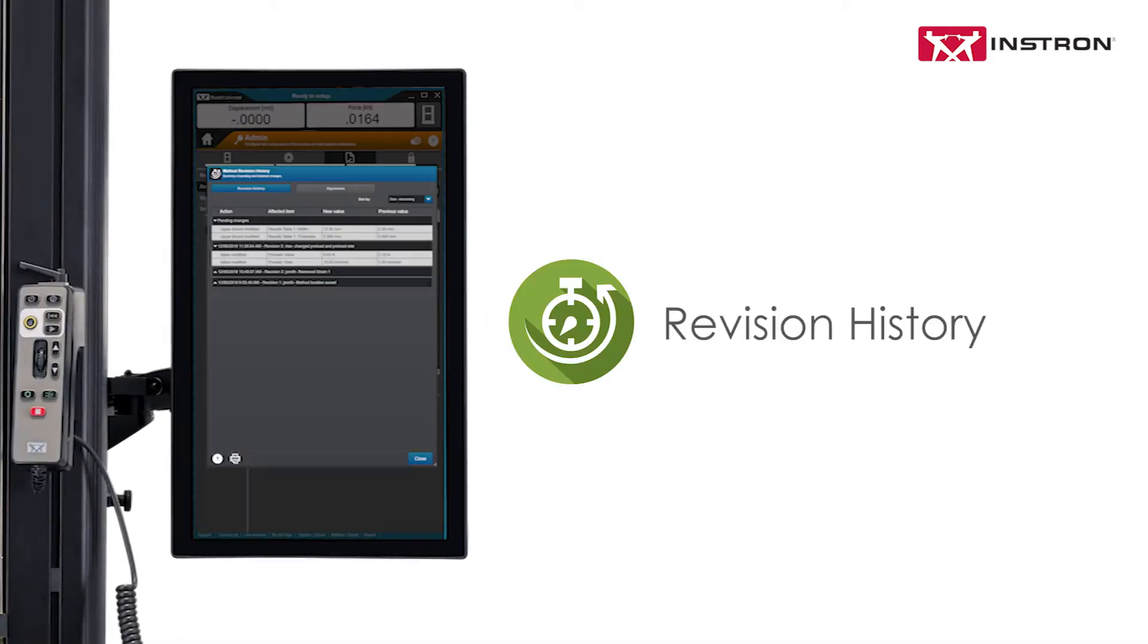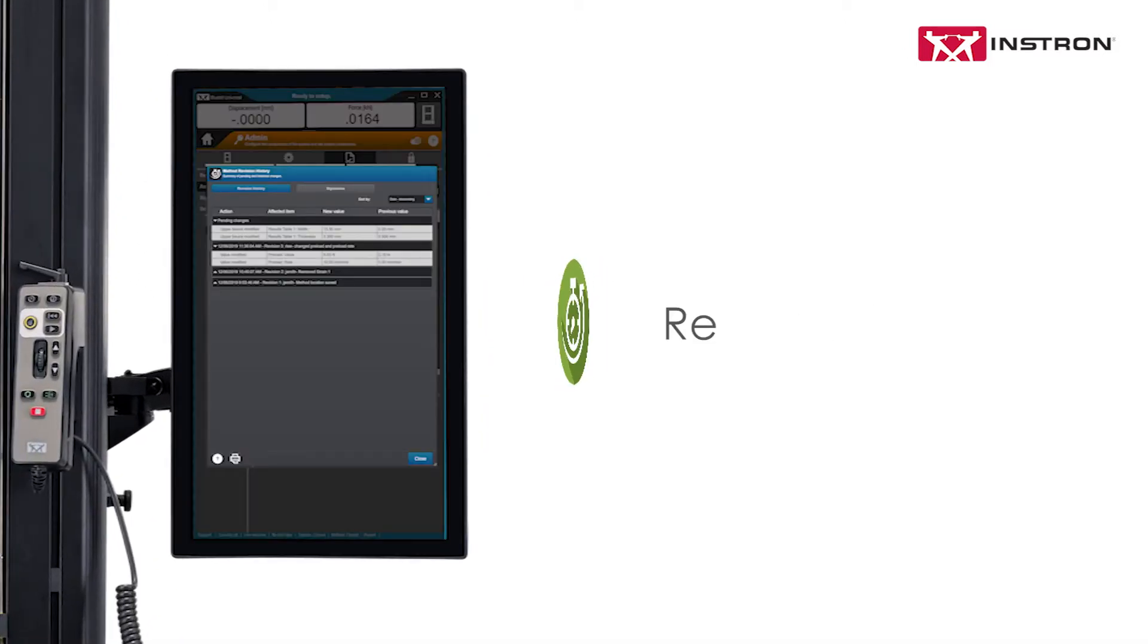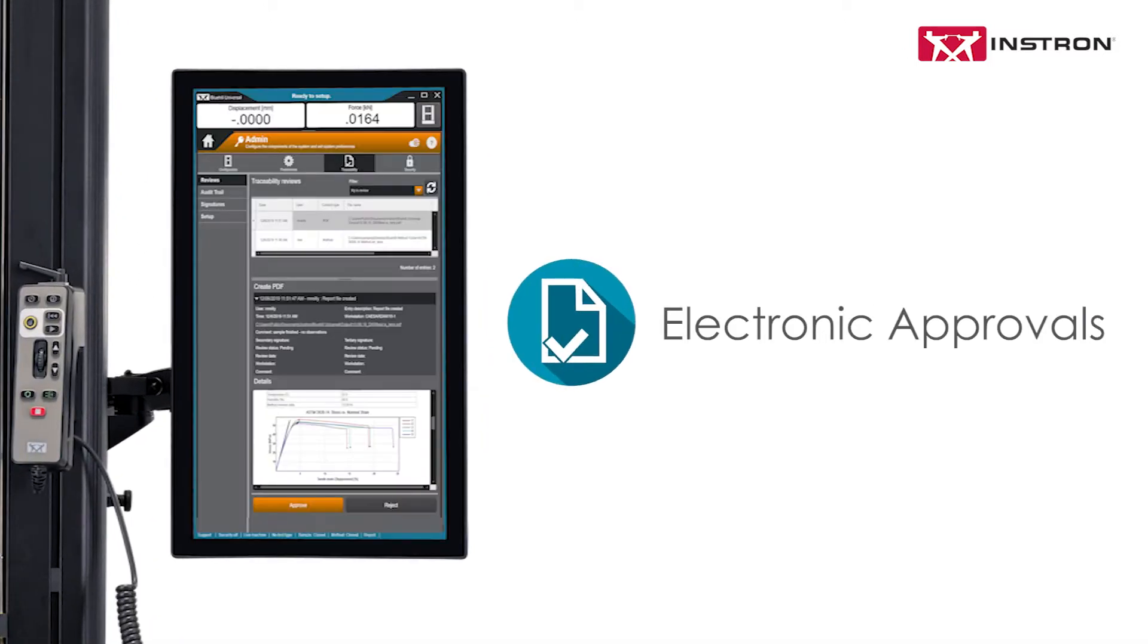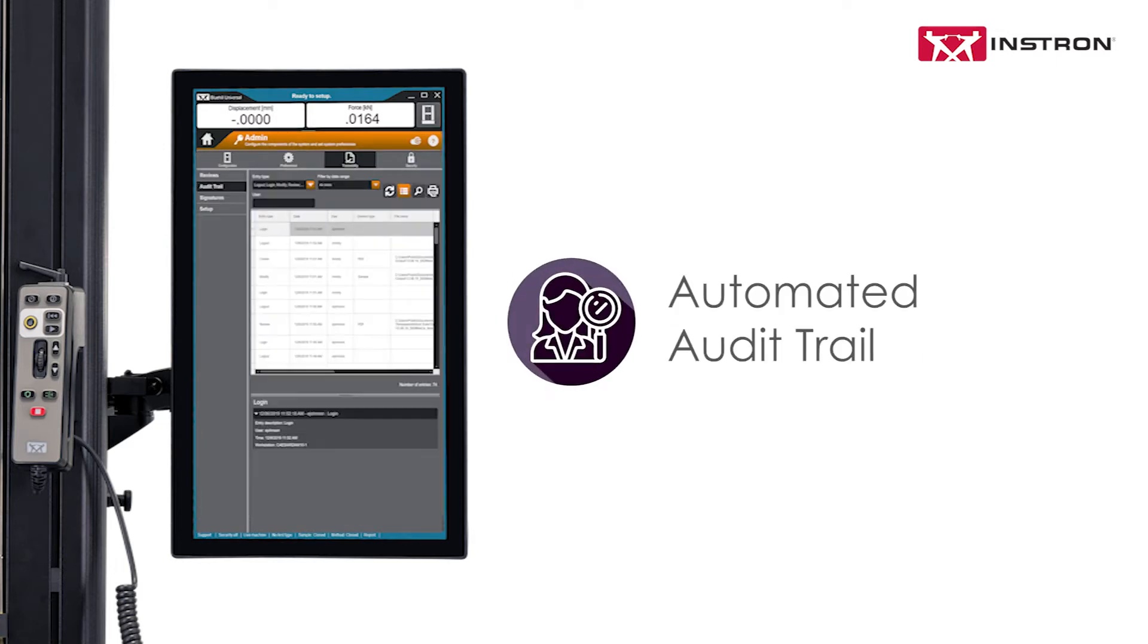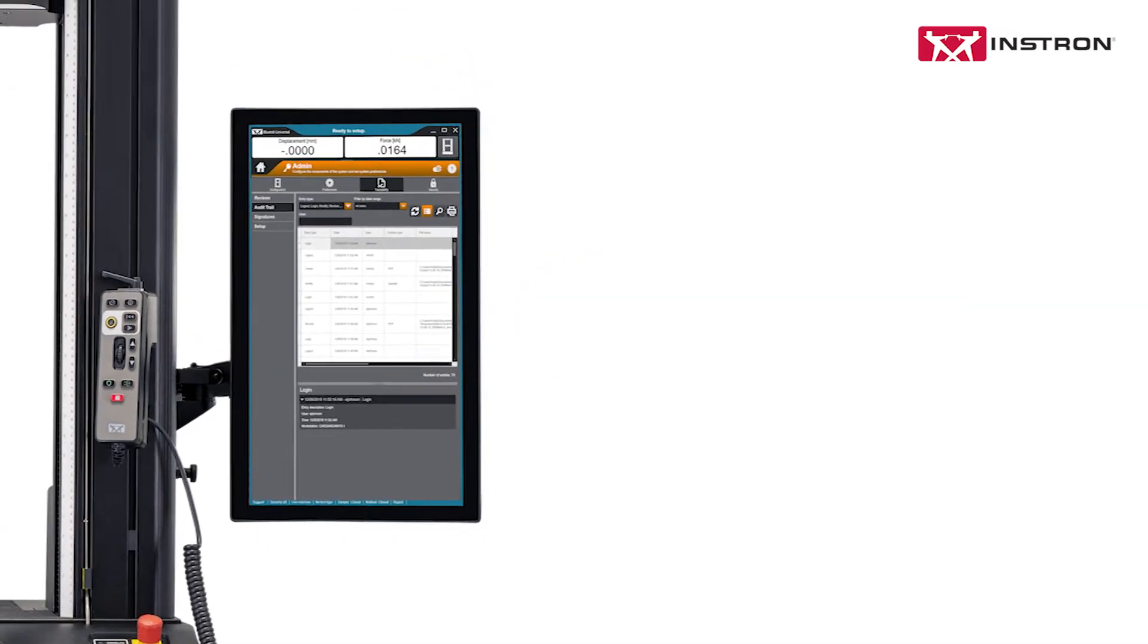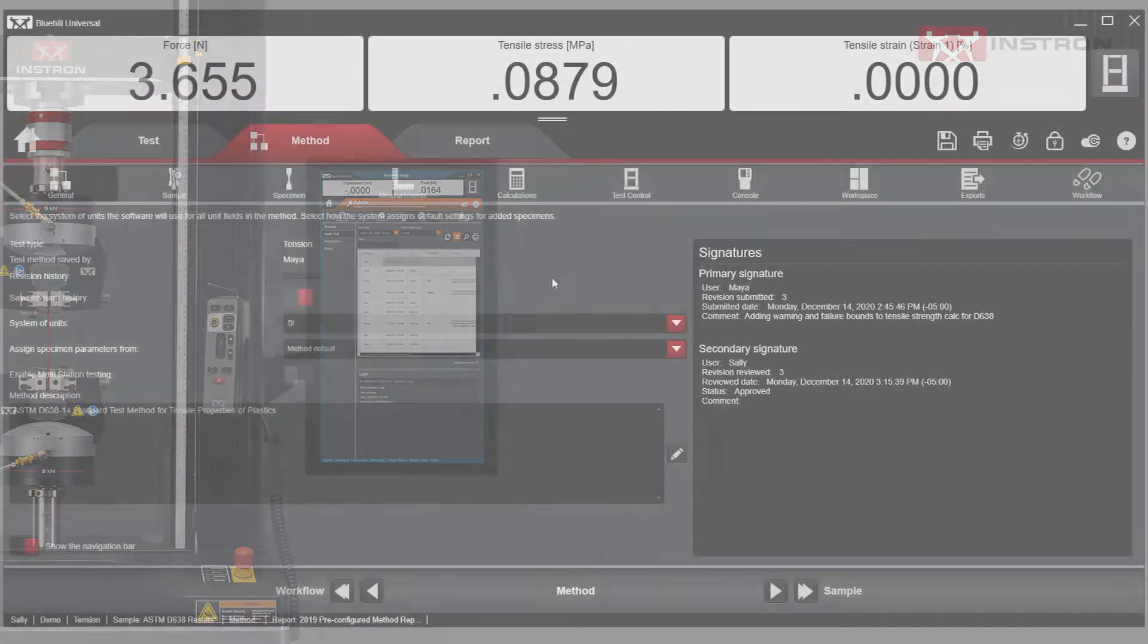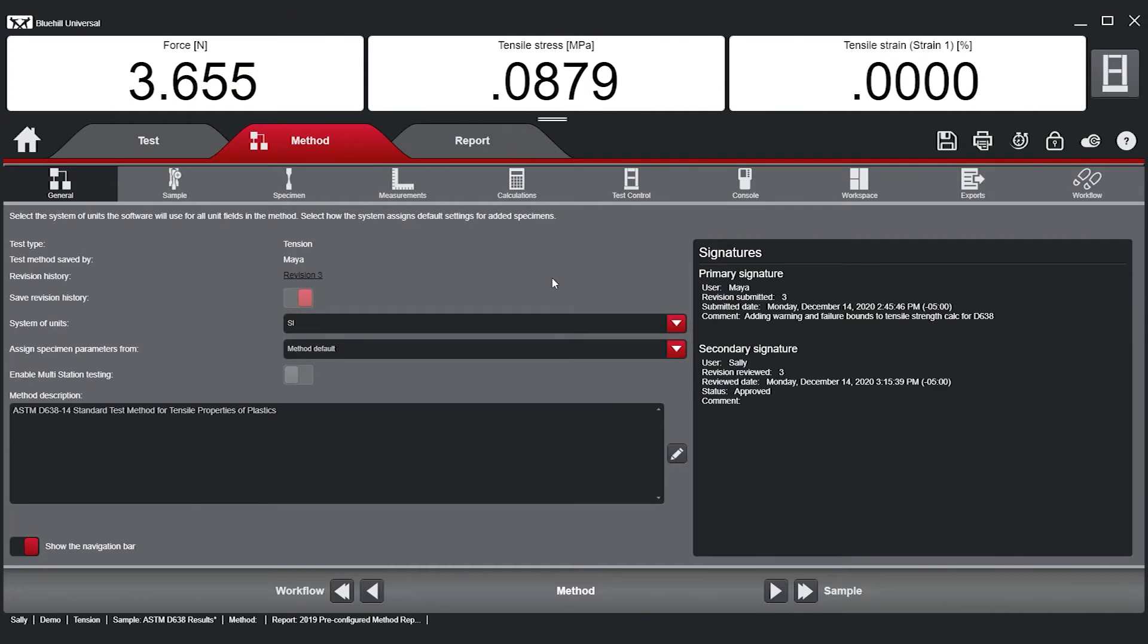Through seamless integration of revision history, electronic approvals, and an automated audit trail, this powerful add-on combines with Blue Hill's built-in security to provide unmatched data traceability.